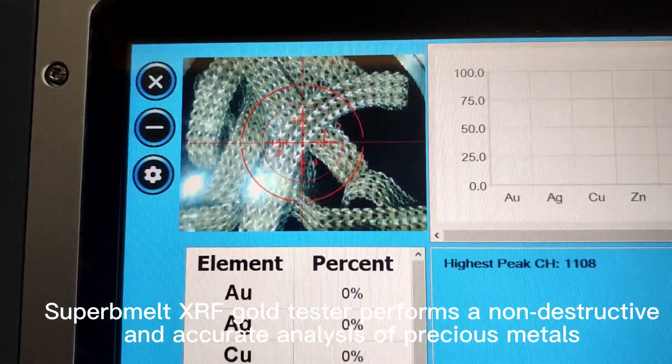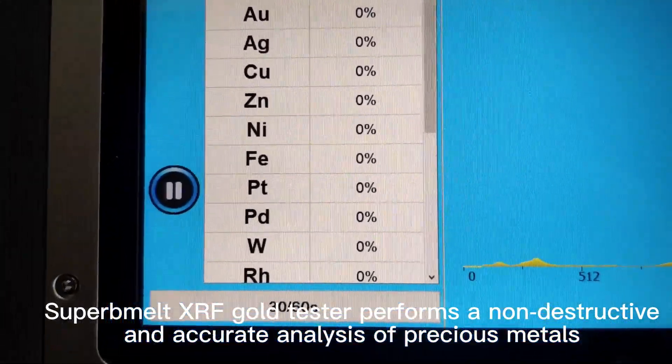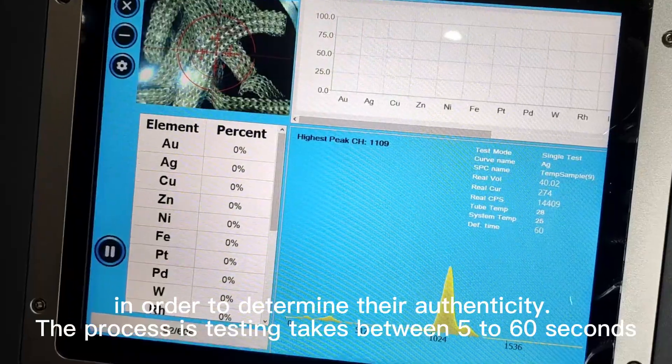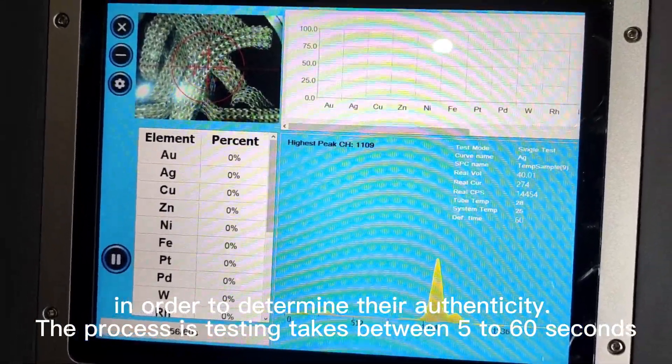Superbelt XRF Gold Tester performs a non-destructive and accurate analysis of precious metals in order to determine their authenticity. The testing process takes between 5 to 60 seconds.